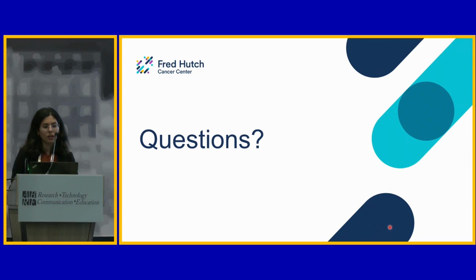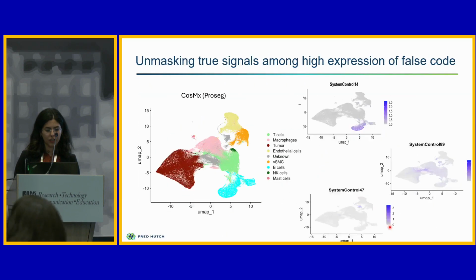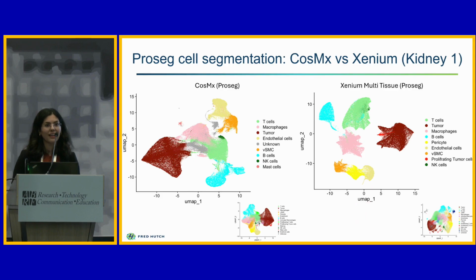So as I said, for the cell segmentation, the very first slides were all based on the cell segmentation coming out of the instrument, but ProSeg was actually getting the decoding data and doing our own cell segmentation. So these were our own cell segmentation. Sorry, I'm just confused about this because that means that you're using your output as part of your segmenter and then calculating again, right?